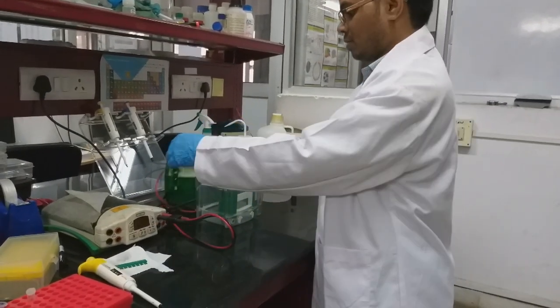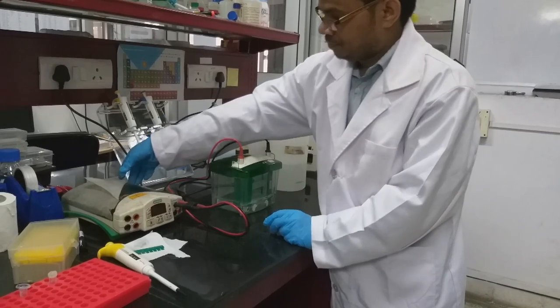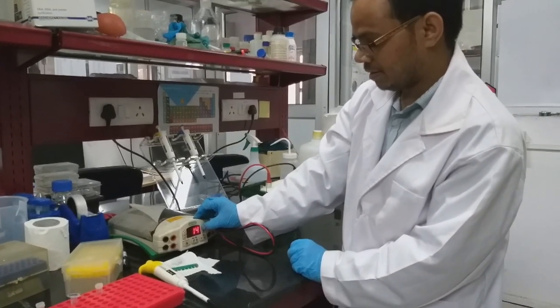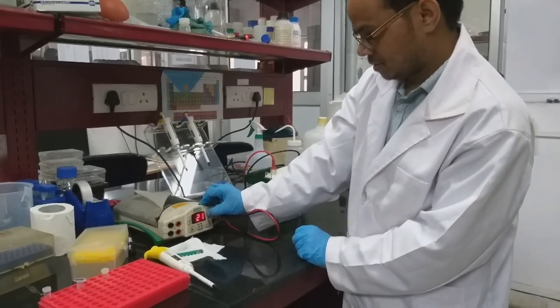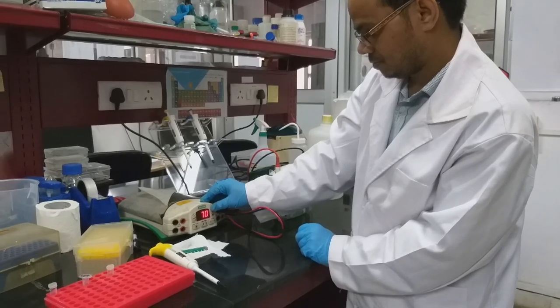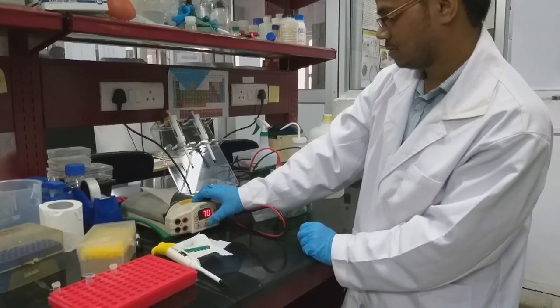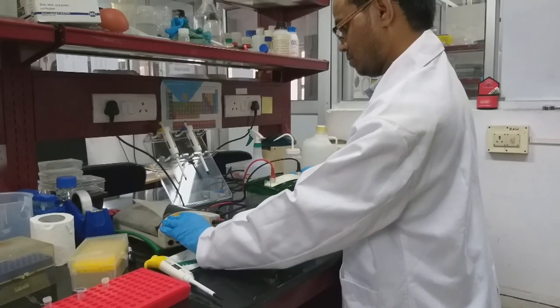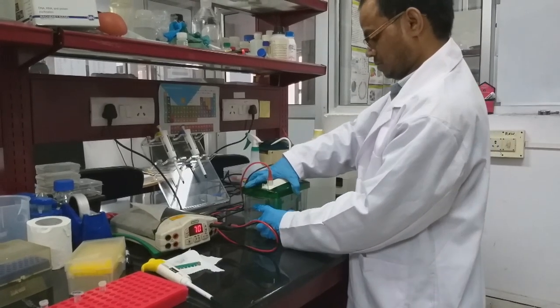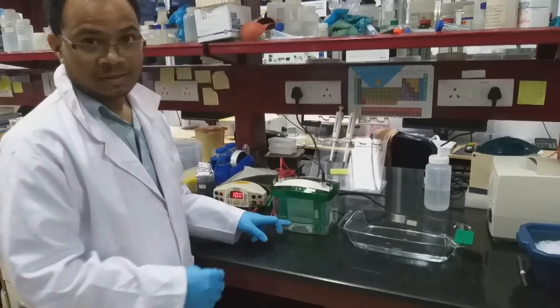Once the loading is over, we have to fix the gasket. I am going to set it at 70 volts. Then run. As we can see, it is almost over.